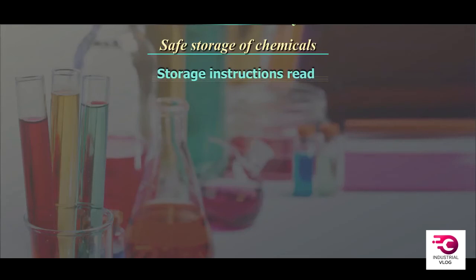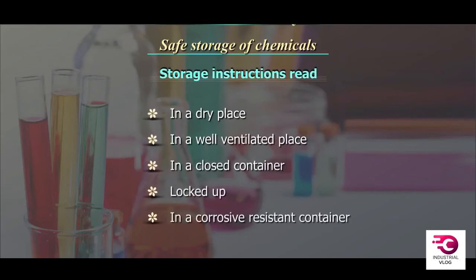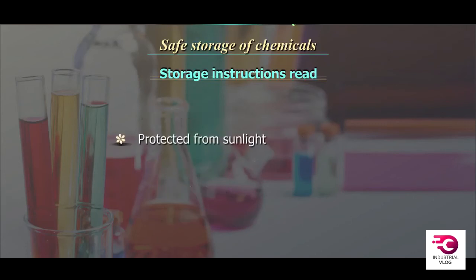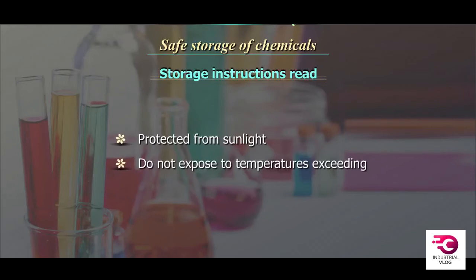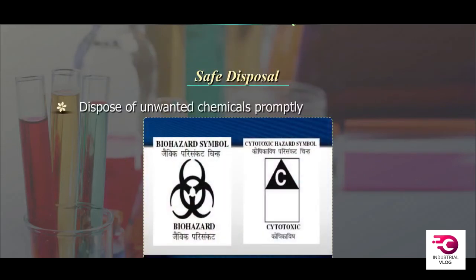Storage instructions read: in a dry place, in a well ventilated place, in a closed container, locked up, in a corrosive resistant container, protected from sunlight, do not expose to temperatures exceeding, look at the labels, and away from other material. Safe disposal. Dispose of unwanted chemicals promptly.